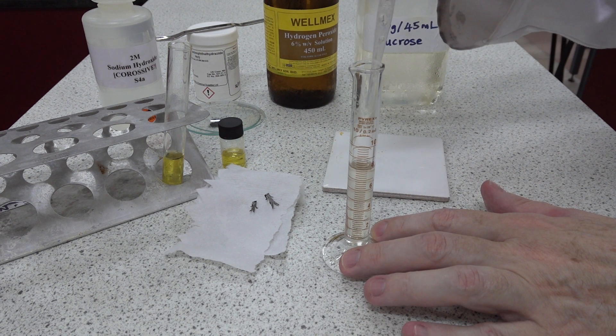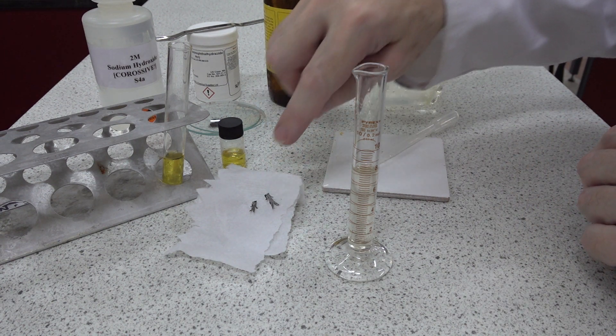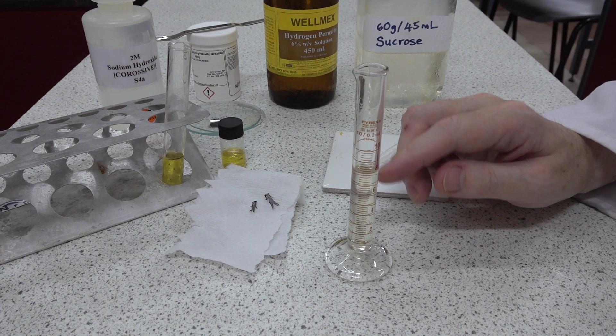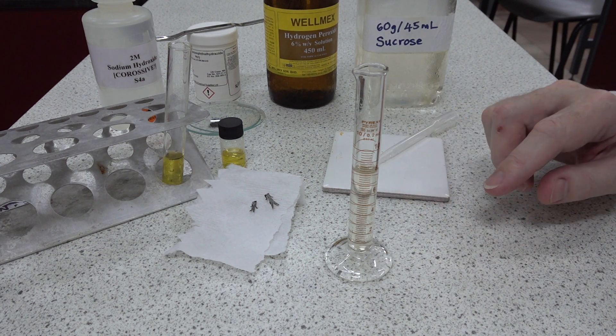One of the key reactions here is that the manganese dioxide on the piece of magnesium will react with the hydrogen peroxide, yielding oxygen gas at the surface of the magnesium. This should cause it to float up. Otherwise, this is an alkaline solution.